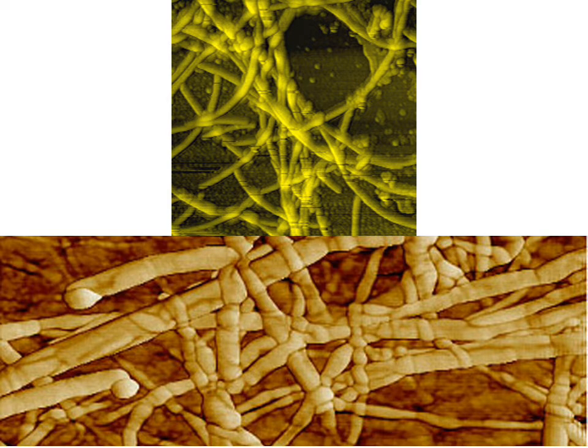These are some examples of what a scanning tunneling probe image would look like. And this is at the atomic level. So the metal probe has come along the outside of this image and produced that visible surface.